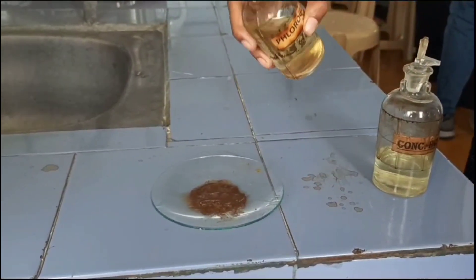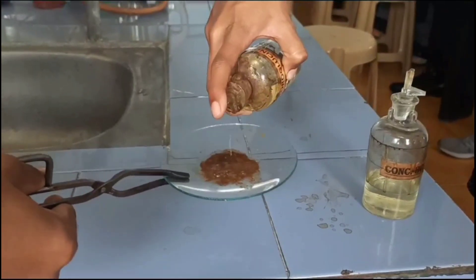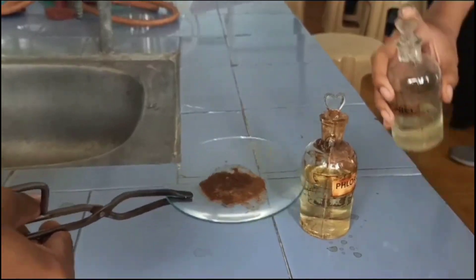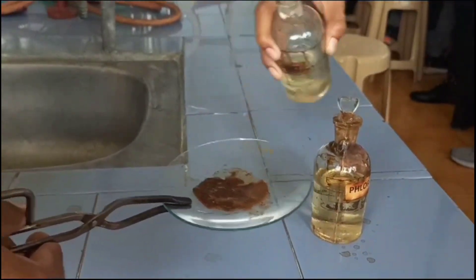After cooling, add fluoroglucinol and concentrated HCl in equal concentration. By adding fluoroglucinol and concentrated HCl, lignification of the tissues like xylem and sclerenchyma takes place. Due to lignification, the tissues take up a red color.